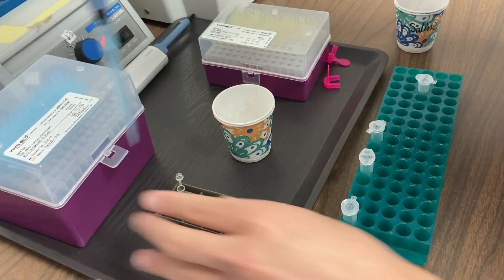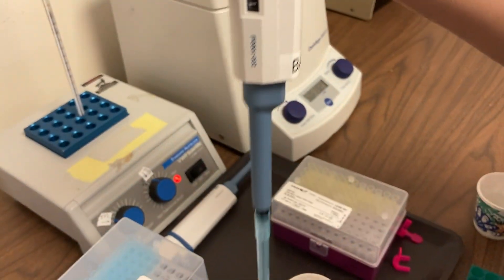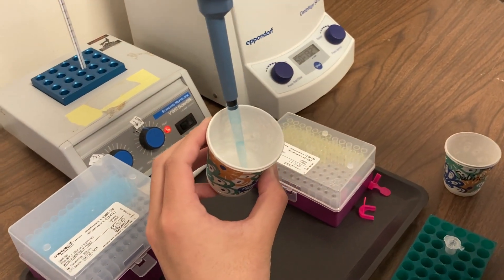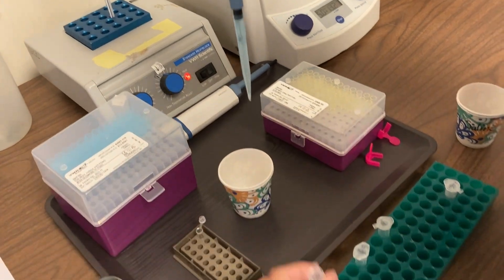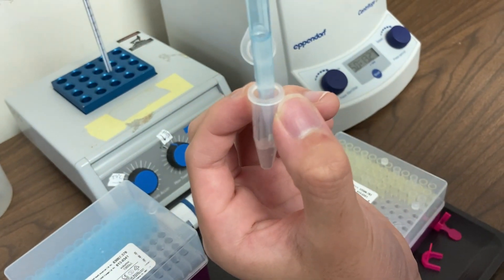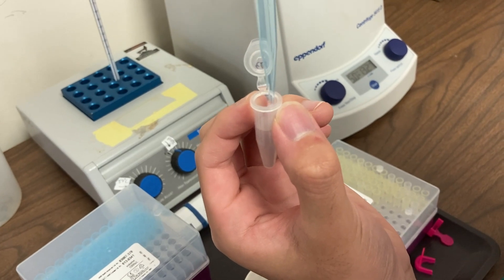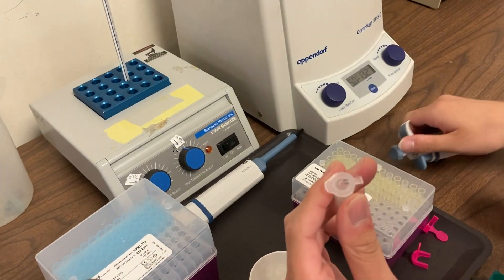Attach a tip to your micropipette and adjust the volume to 1,000 microliters. Then you'll use your micropipette to draw up your resuspended cheek cells in saline and add that volume to your microtube. When you've finished, cap your tube, put your tip in the wastebasket, and you're ready for the next step.